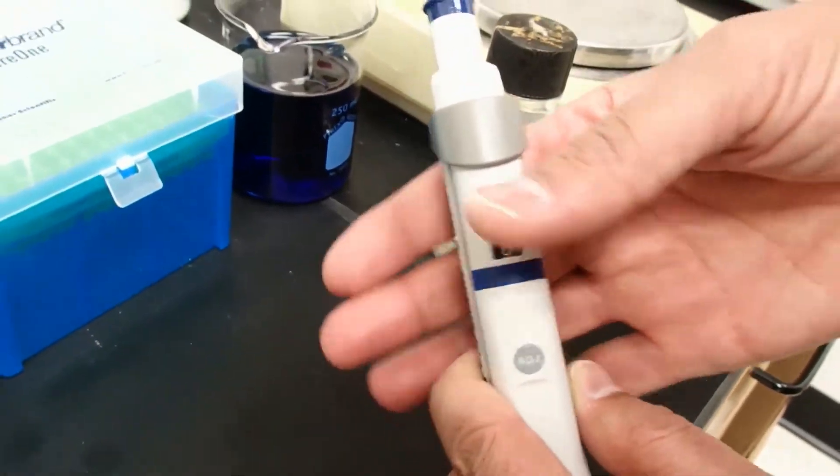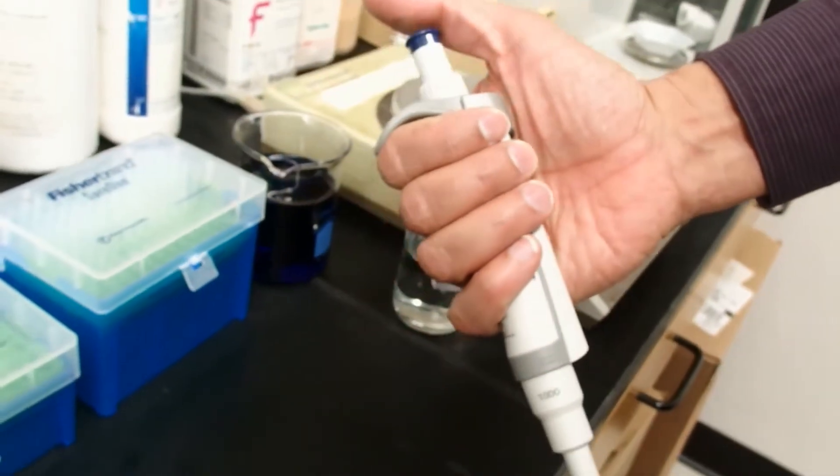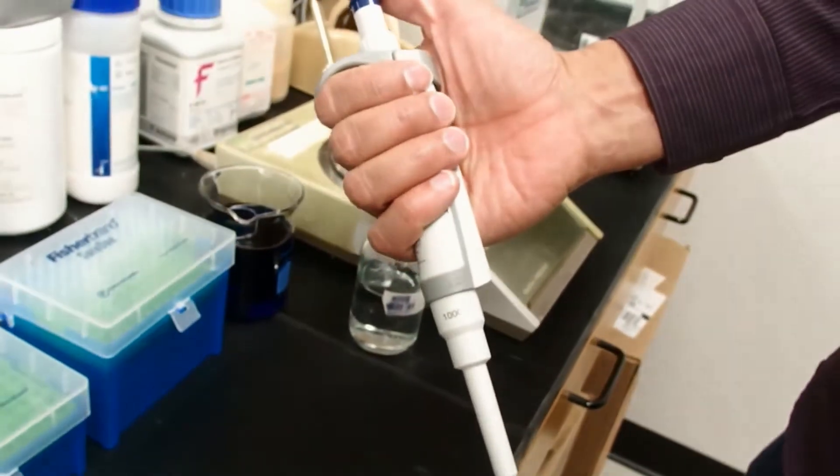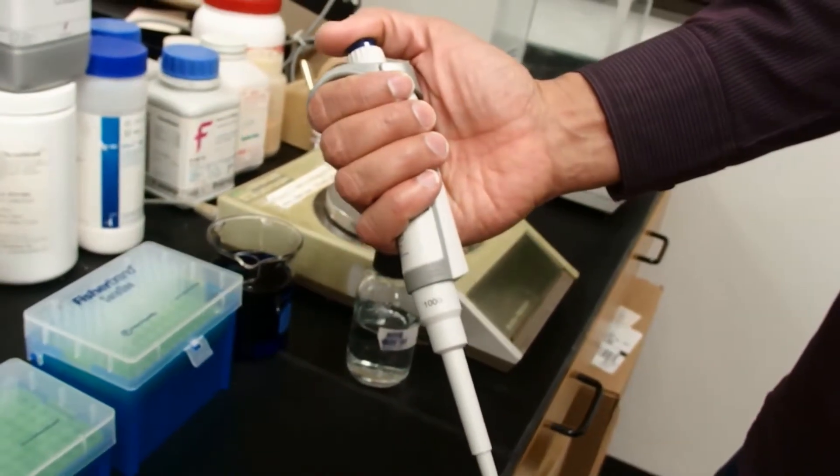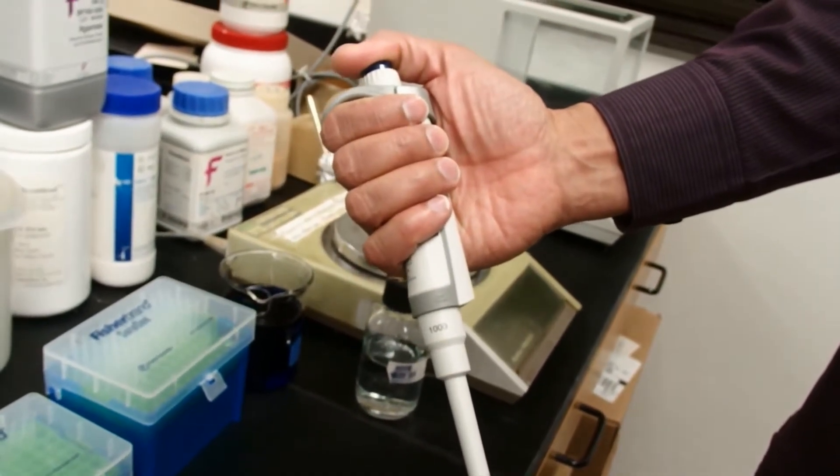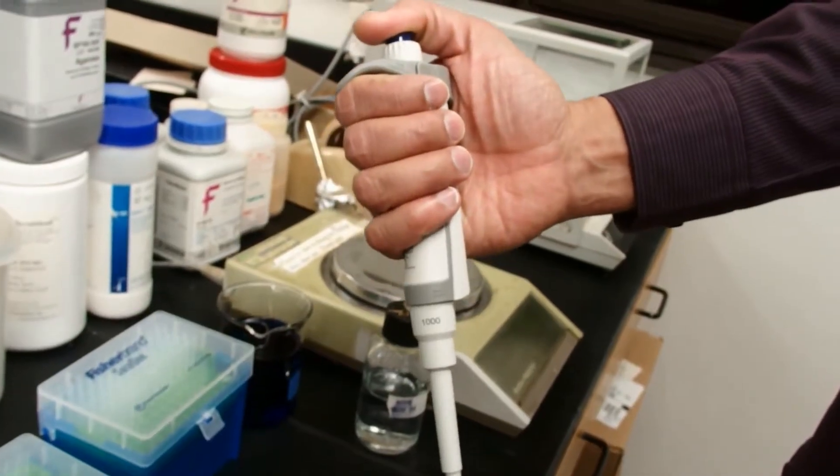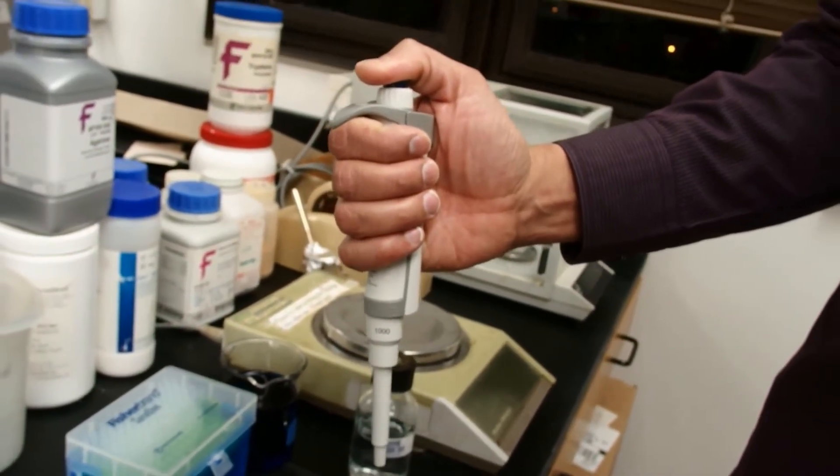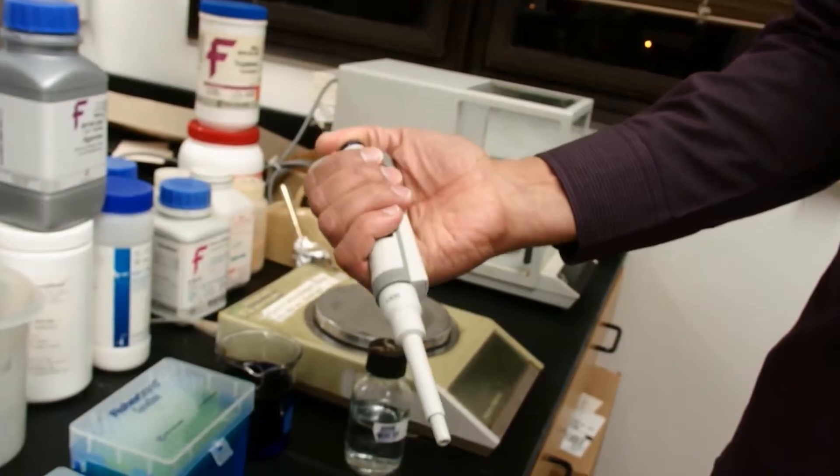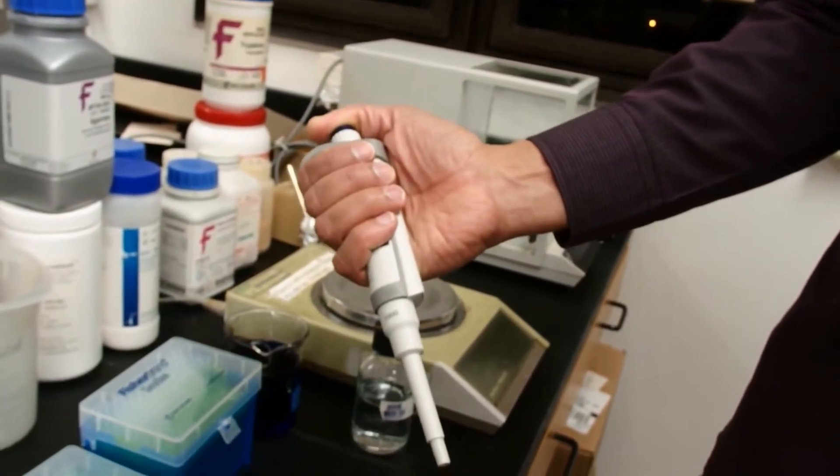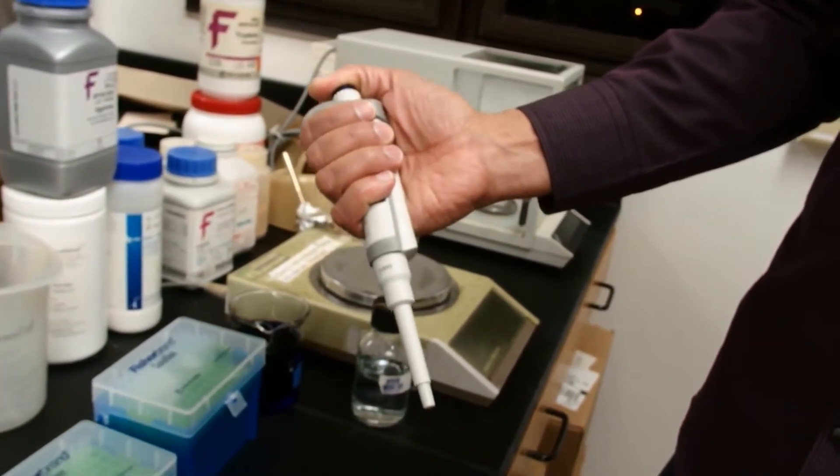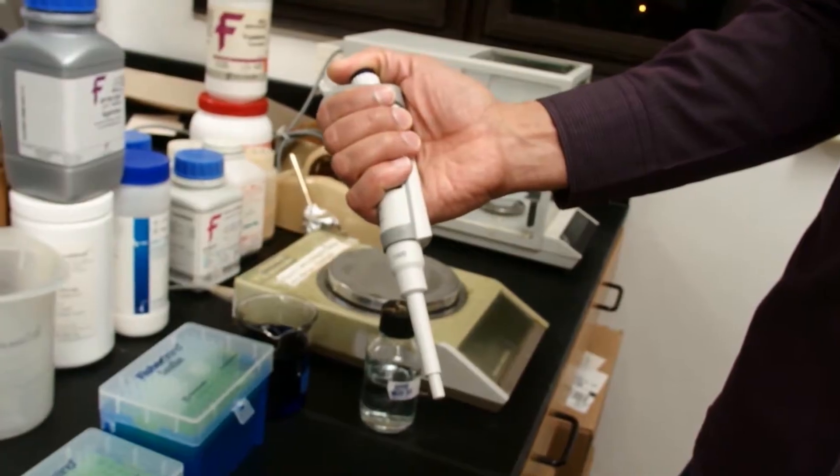Other parts of the pipette are the plunger. This plunger is pressed in until you feel resistance, and that will determine how much volume you pick up. Then it has a second stop. If you press harder, you'll be able to blow out residual liquid in the tip.